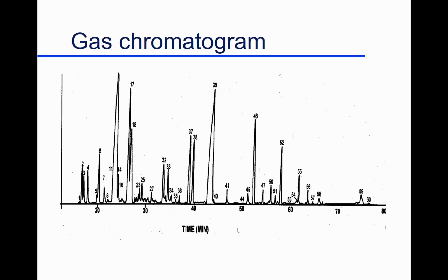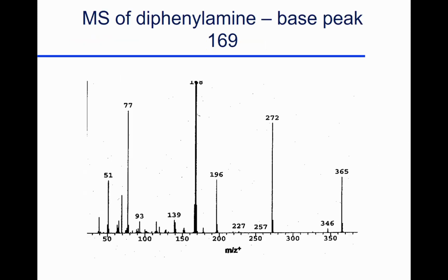And we're not interested in the majority of them, but we are interested in this residue of diphenylamine. But which ones of these are diphenylamine? And can we guarantee that it's nothing else coming underneath it, that it's absolutely pure? And so that gets you into the mass spectrometry part. So if we go ahead and take a look at the mass spectrometry of the diphenylamine, these are the fragments. When diphenylamine goes into the mass spectrometer, it blows into bits. These are the bits it blows into.